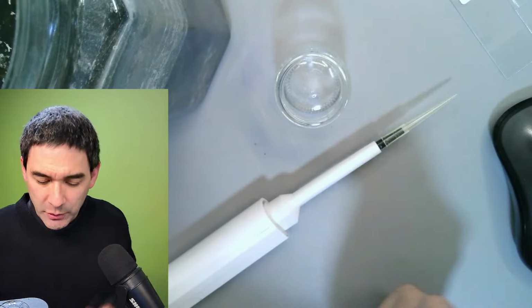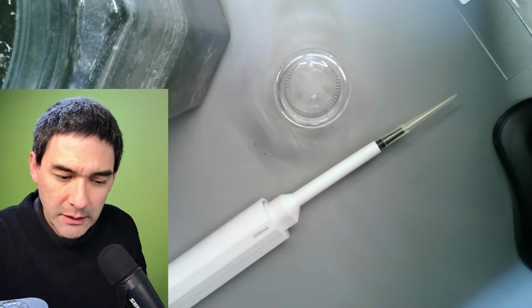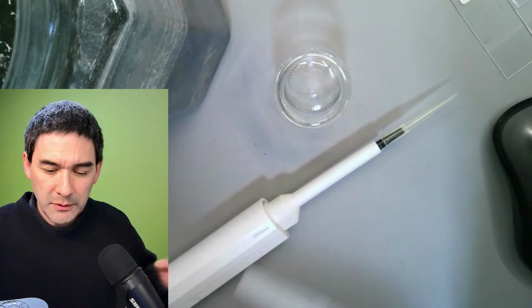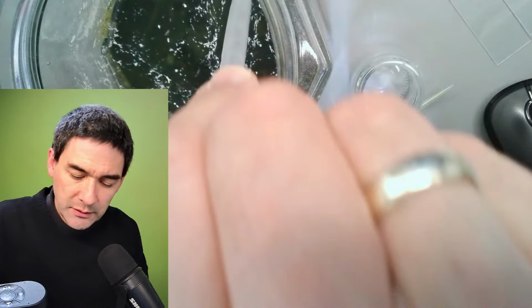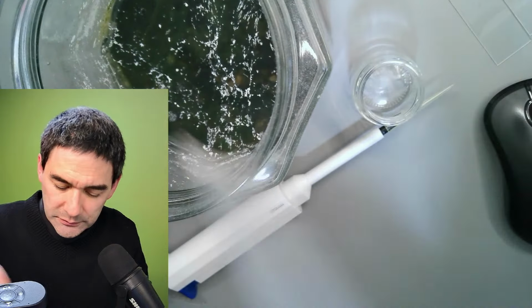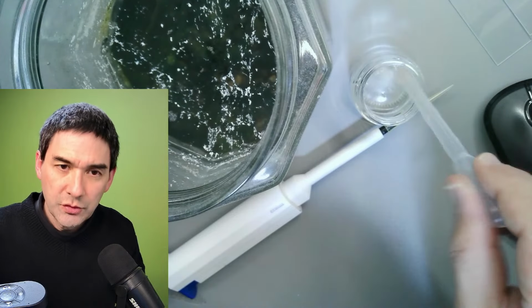And I now need to somehow transfer a little bit of the water over here. I don't want to pour it over. It's kind of disgusting as well because, yeah, I'm just going to use some pipette, I guess. Yeah, maybe that'll do. Okay, so just taking some of this stuff here. Just generously transfer.